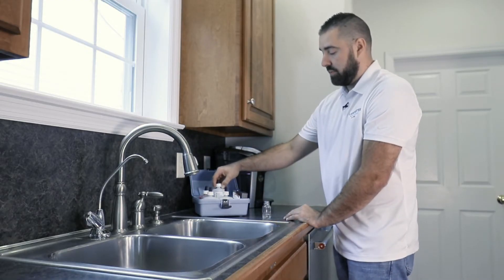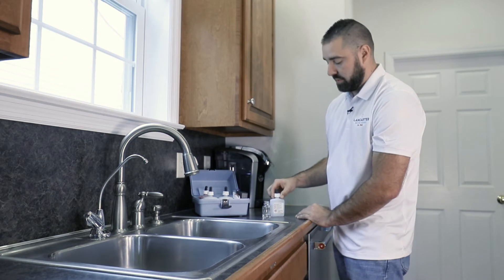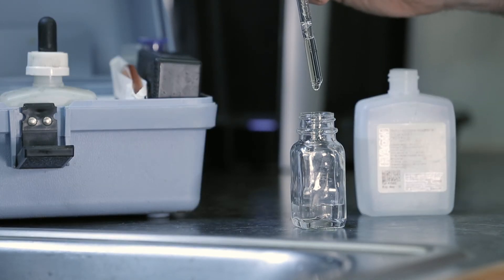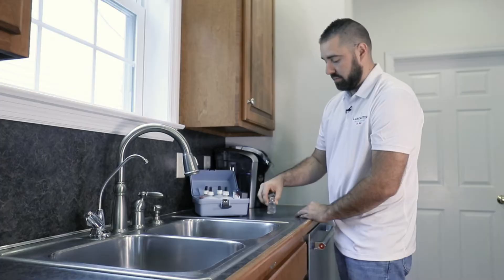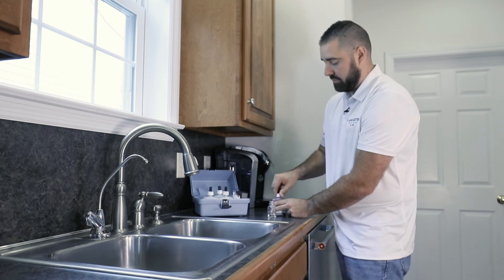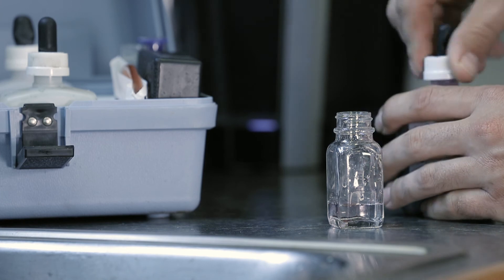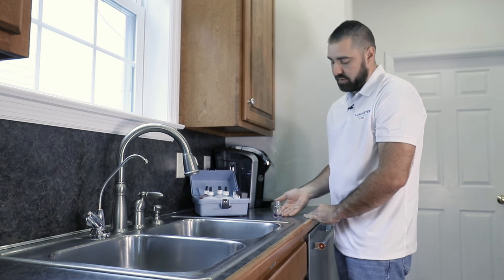In the kit are three hardness solutions, each numbered 1, 2, and 3. We will take hardness solution number 1 and put three drops in. Give it a little swirl. Next is number 2 — one drop — and swirl. As you can see here, the water has turned purple.